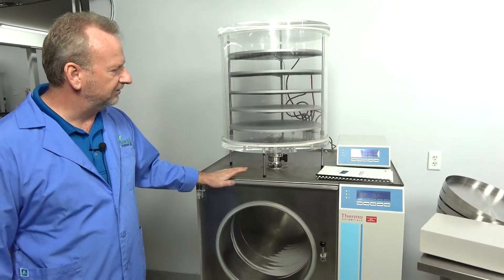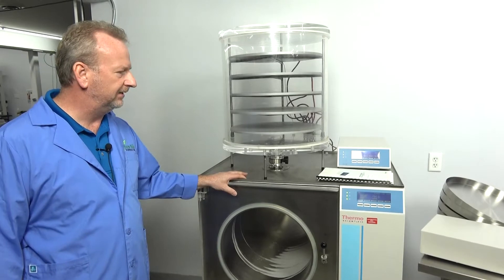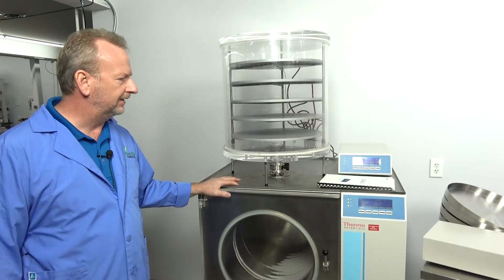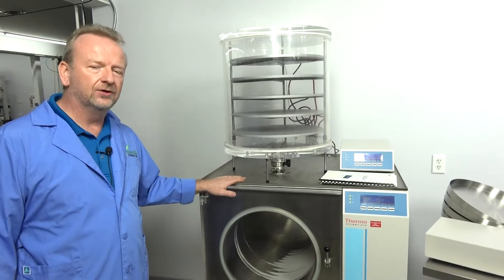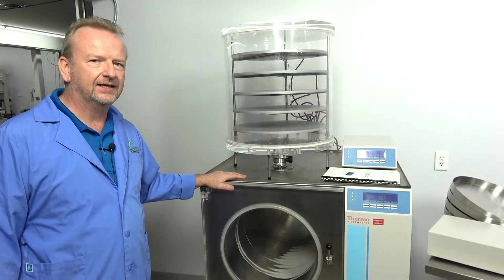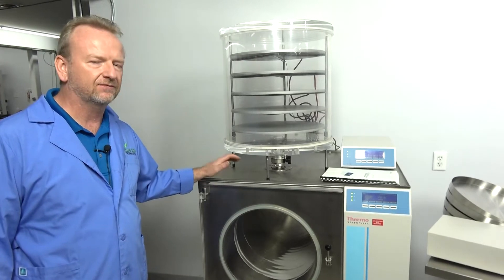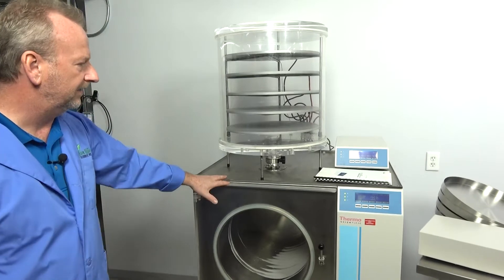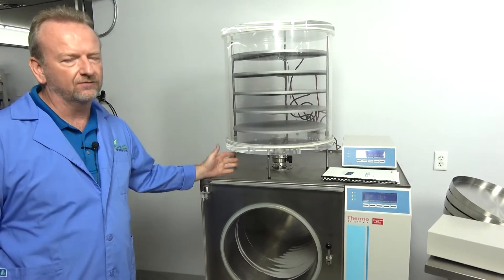We're going to talk about some of the features of this unit. It's extremely durable, a well-built German machine. We've been through it, looked at it — there's nothing uncommon that can't be fixed. It's just a refrigeration system with a vacuum pump, so it's something that's really easy to service if needed.